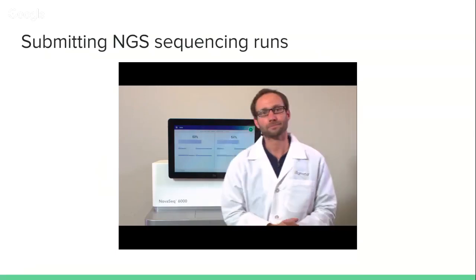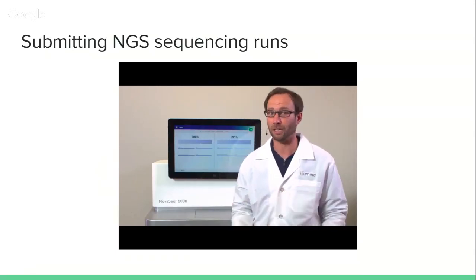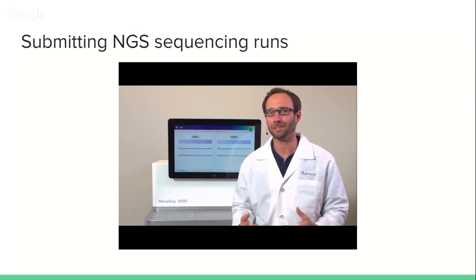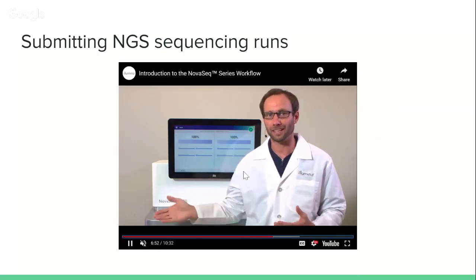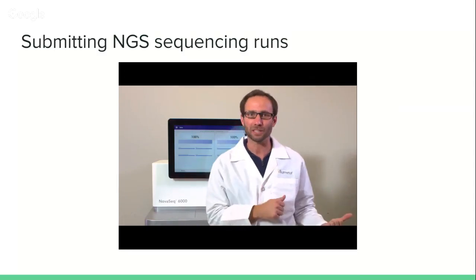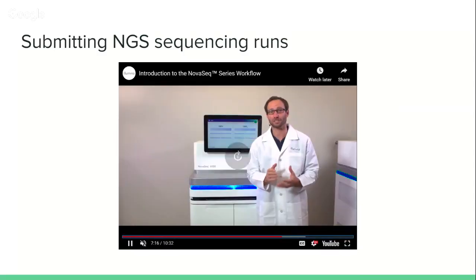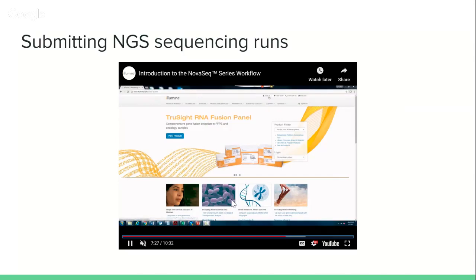If you require less sequencing, you can put it into the different lanes individually for the 4 lanes of the S4 NovaSeq flow cell, or the other lanes in the other smaller flow cells for NovaSeq. So once you've set out the sequencing run, it'll show you how it's going, and it'll have these flashy lights here showing progress. If it turns red, it's a bad sign.